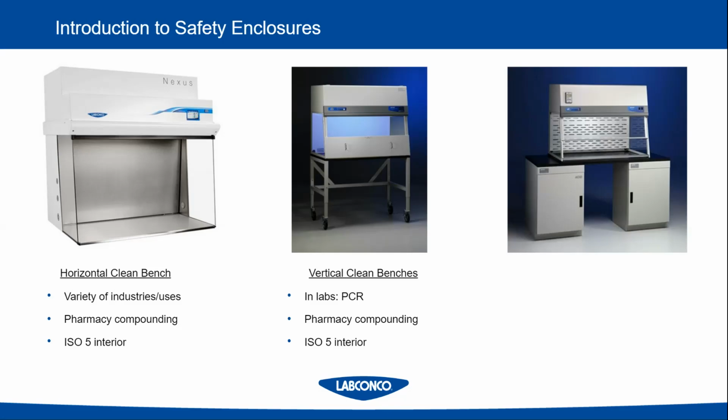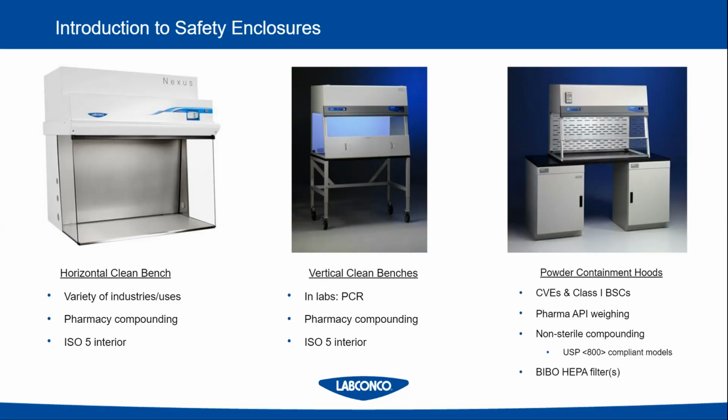A vertical clean bench is almost the exact same as a horizontal clean bench, except the HEPA filter is on top instead of on the back wall. And this just provides a slightly different airflow in case of large equipment being on the inside.